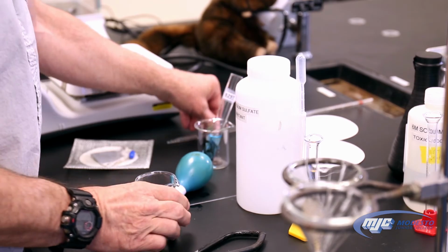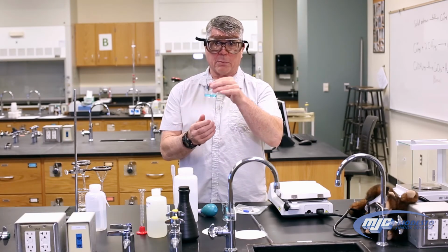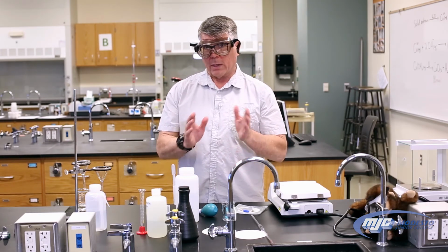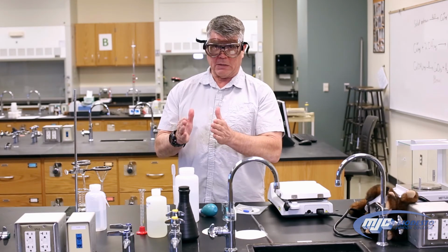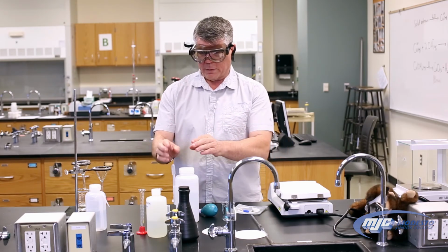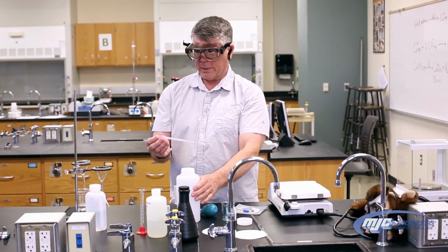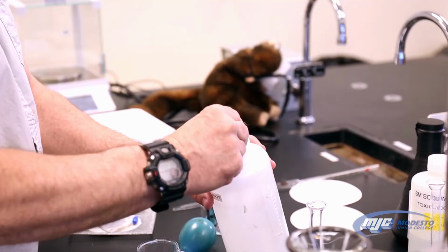So now, you can tell it's blue, that tells us that there's copper two ion in there, but there's also some lead two ion in there. The first thing we're going to do is add about 3 milliliters of sodium sulfate. Again, remember, the lead two ion will precipitate out with the sulfate, forming insoluble lead two sulfate. But the copper ion does not form an insoluble sulfate. So to measure out our 3 mils, I'm just going to use this transfer pipette because the exact volume is not really important. It has a 3 mil mark there.